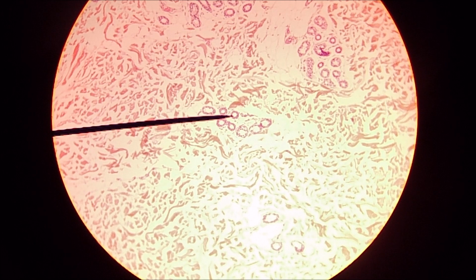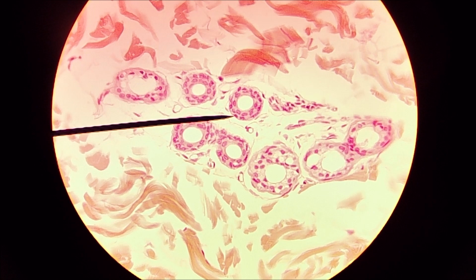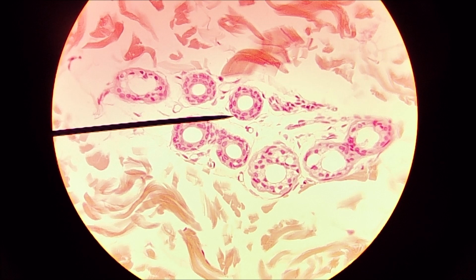So if I zoom this in just a little bit more, what you have here is a nice eccrine gland, or at least part of one. This would be one big long tube, all wound up, and when it's cut, it gives you this appearance of a bunch of circles. If you look at these individually, you'll see round nuclei and more than one layer of thickness that makes these stratified cuboidal epithelium.